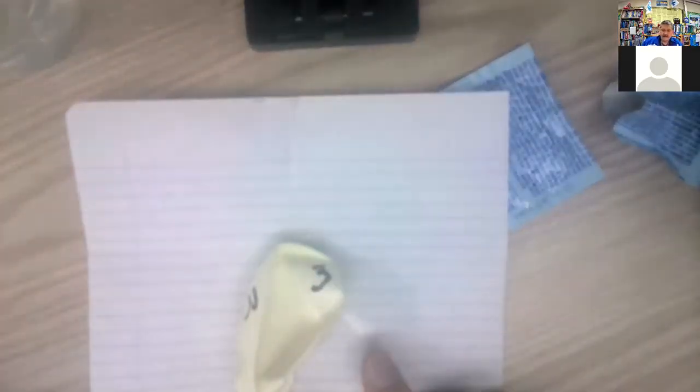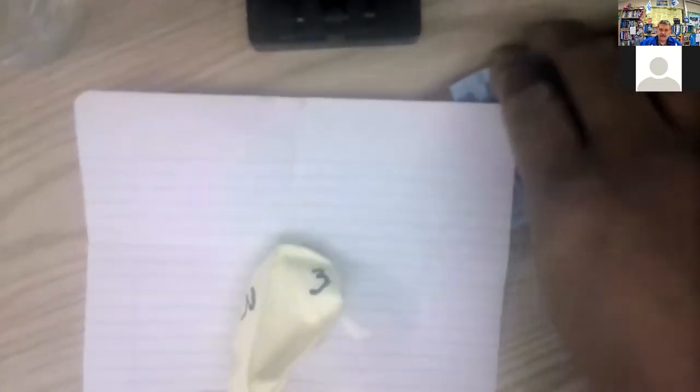A little bit on the paper this time, so I'm going to fold that over to the very, very end. Okay, so there's 1 tablet's worth, and a little bit right here. So we'll pick that up after I get the 2 tablets and make this 3 tablets.